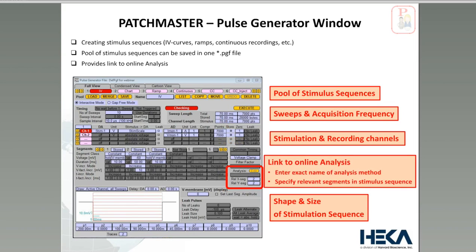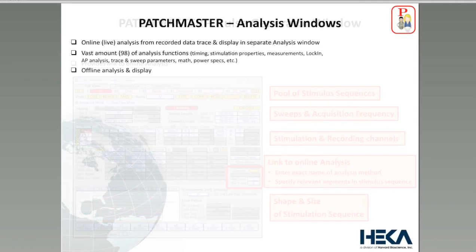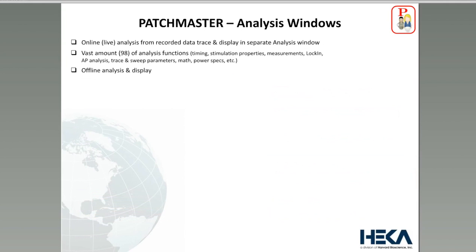And this is the link. Here you can link the online analysis, or you can link the stimulation sequence to the online analysis. And we will do this as well during the live demonstration. This brings me to the analysis window. Again, a couple of things, three main points that I would like to make.